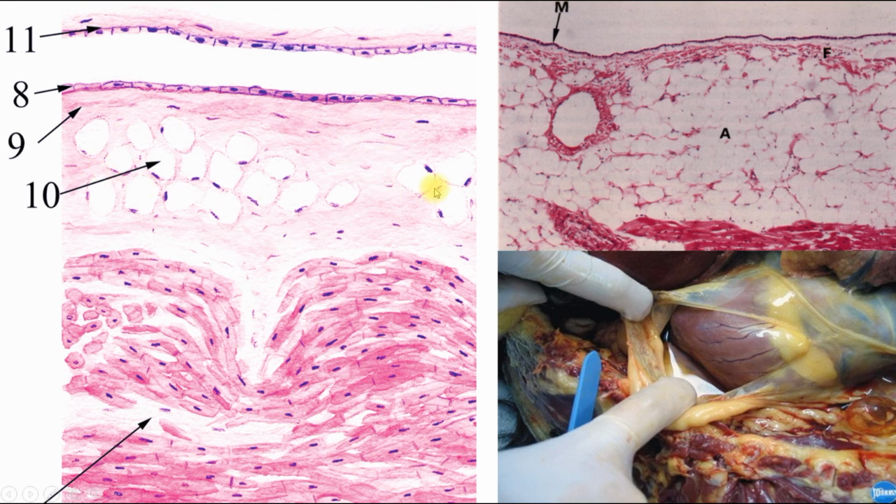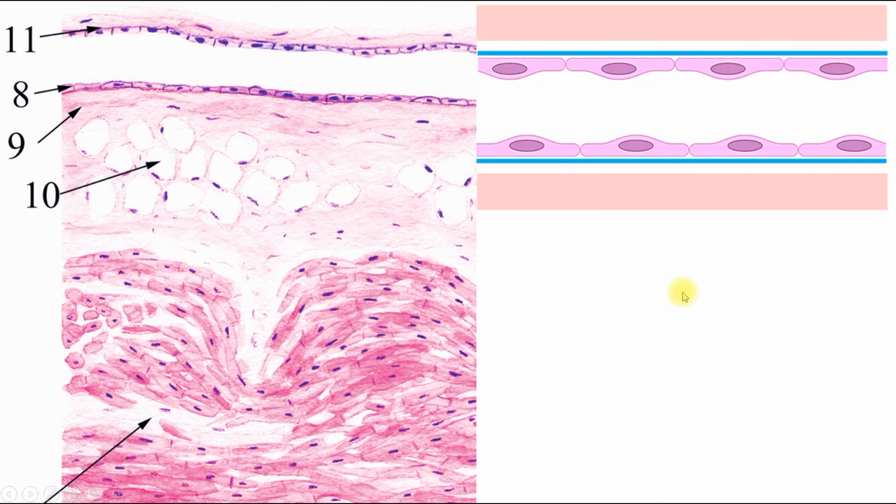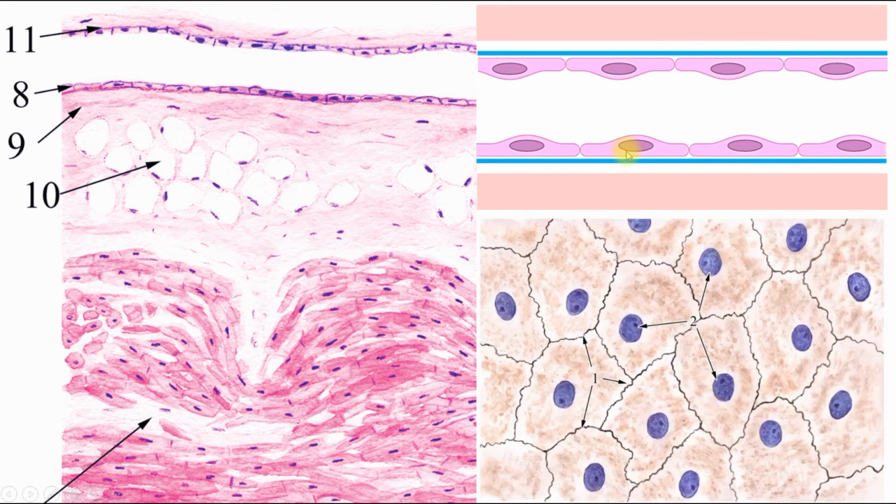And in epicardium, we usually have well-developed adipose tissue, fat which covers heart, and usually this fat follows blood vessels. And pericardium has denser connective tissue which forms this heart bag, and it's needed to provide density of this heart bag. So it's pericardium, mesothelium, simple squamous epithelium, and thin layer of loose connective tissue. And the same structure, almost the same, is present in the epicardium with mesothelium, simple squamous epithelium.